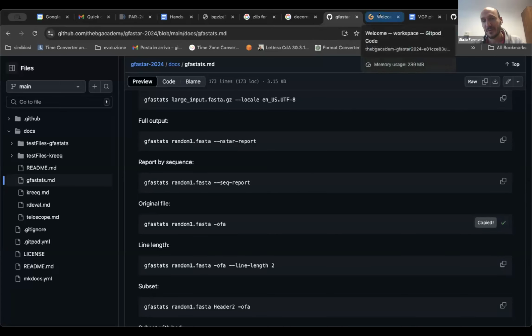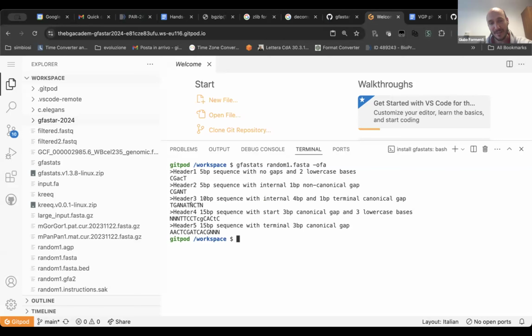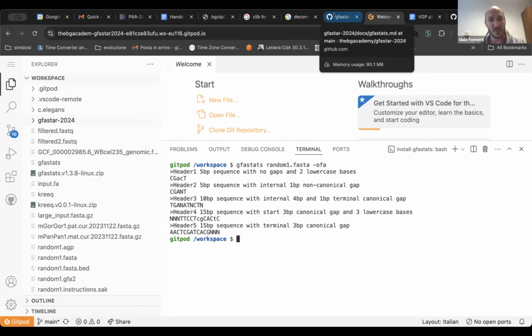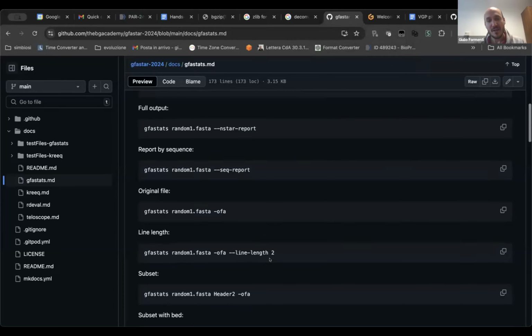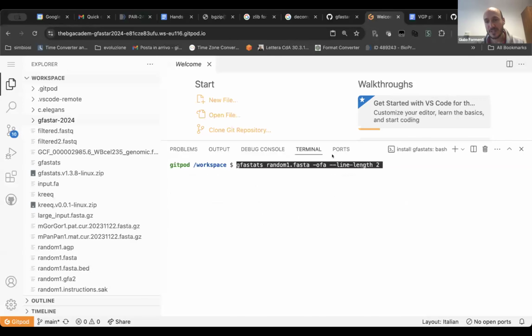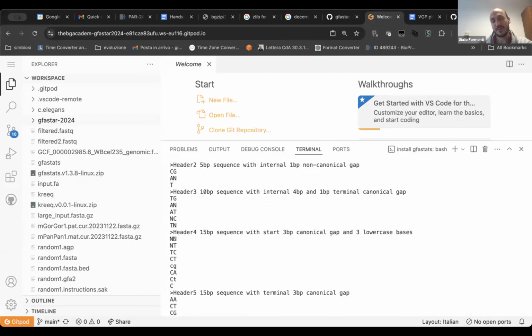A good thing about this is that you can convert between file formats. So as I explained before, of course, we can imagine outputting the same file format. We're just stripping the new lines. That's not particularly useful, so we don't keep those, but we keep everything else. But you can change the way it looks. So we can, for instance, fix the new line lengths like this.